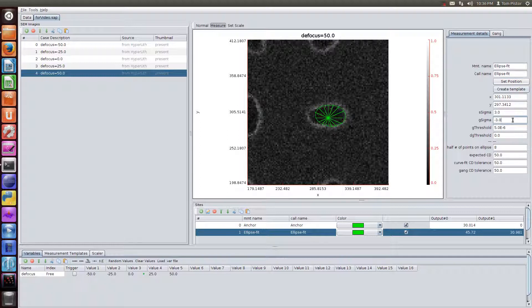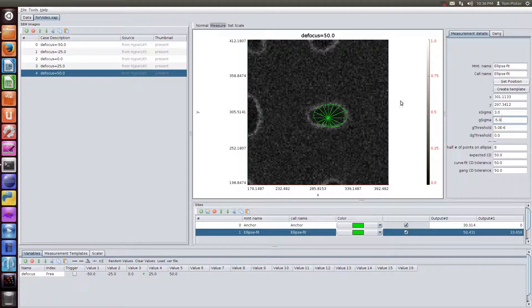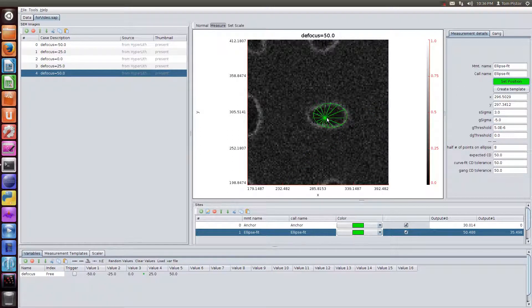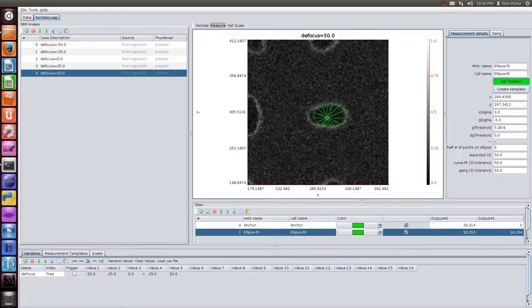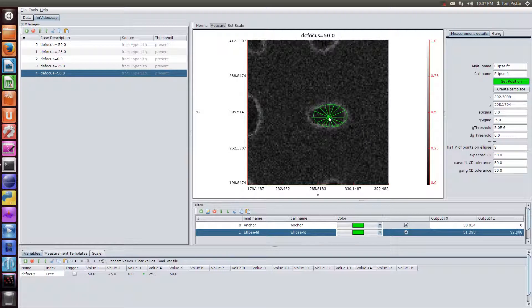I'm also going to play with these smoothing numbers and see how that affects our fit there. Now, because it's an ellipse, and you're fitting into kind of a slightly rectangular contact, it's not going to be the best fit. But this is what people do. This is one way to measure contacts.